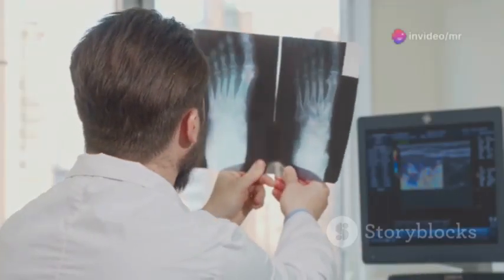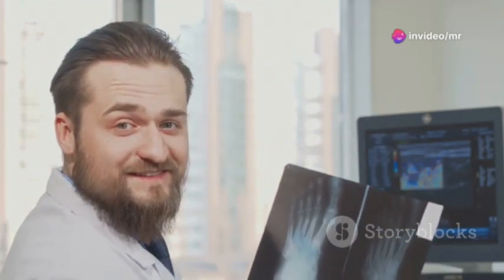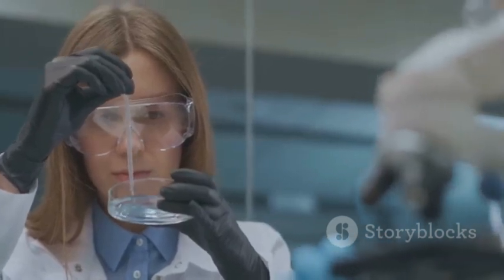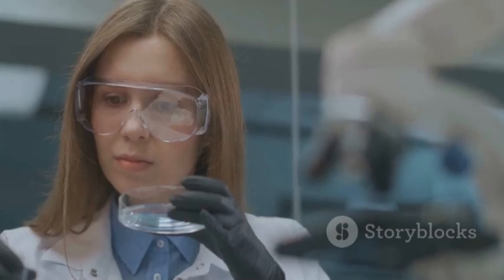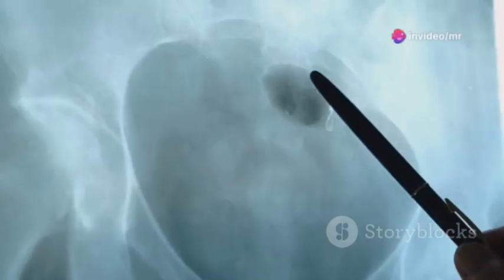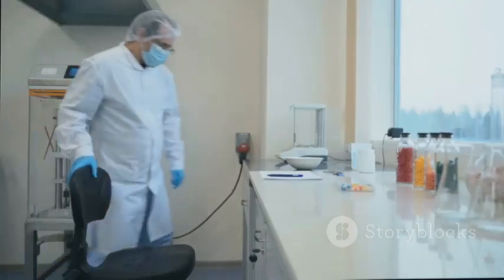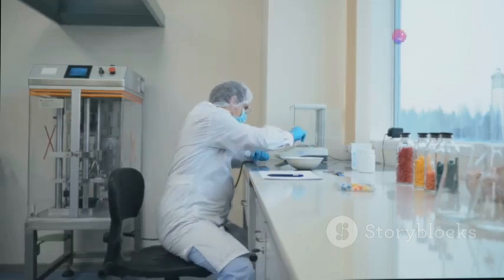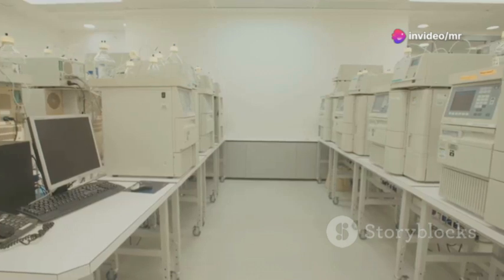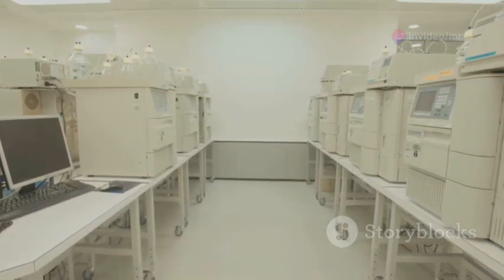XRD helps us study the structure of bones and teeth, providing insights into their composition and health. It also plays a crucial role in developing new drug delivery systems, ensuring that medications are delivered effectively to the right parts of the body. And even analyze kidney stones. By understanding their composition, we can develop better treatments and preventive measures. Pharmaceuticals: XRD is crucial for identifying and characterizing drug compounds, which is essential for the development of new medications. It ensures the purity and stability of medications, making sure they're safe and effective for patient use.